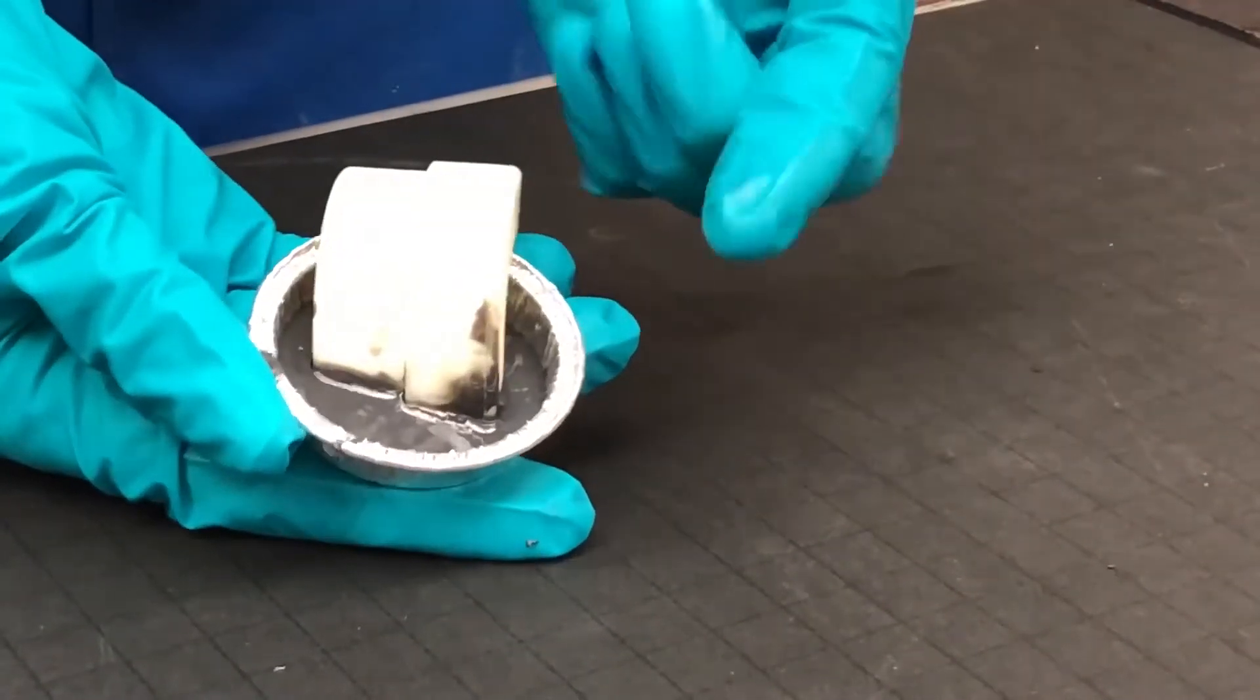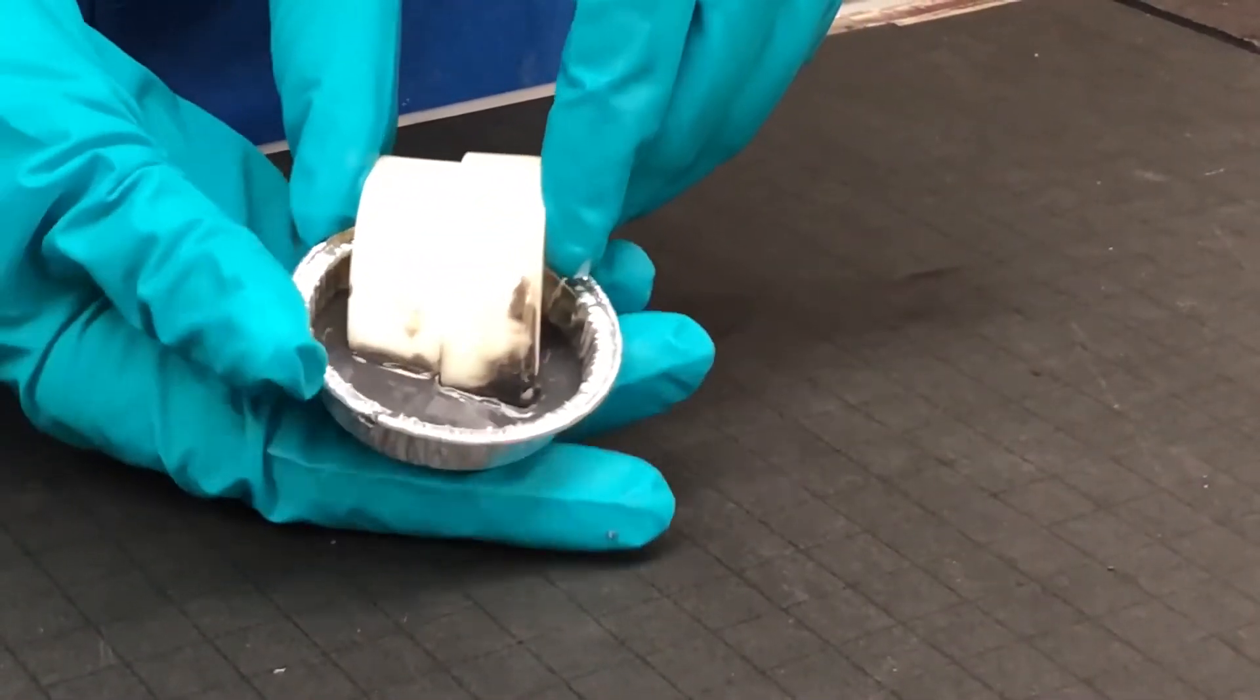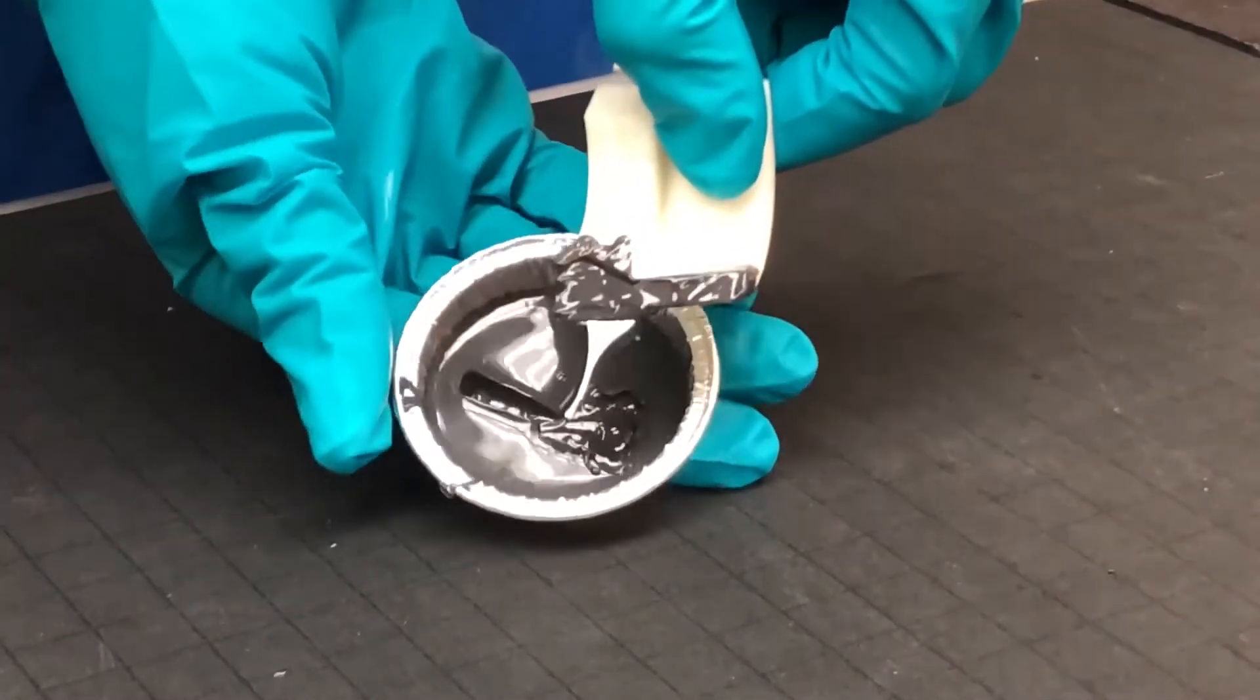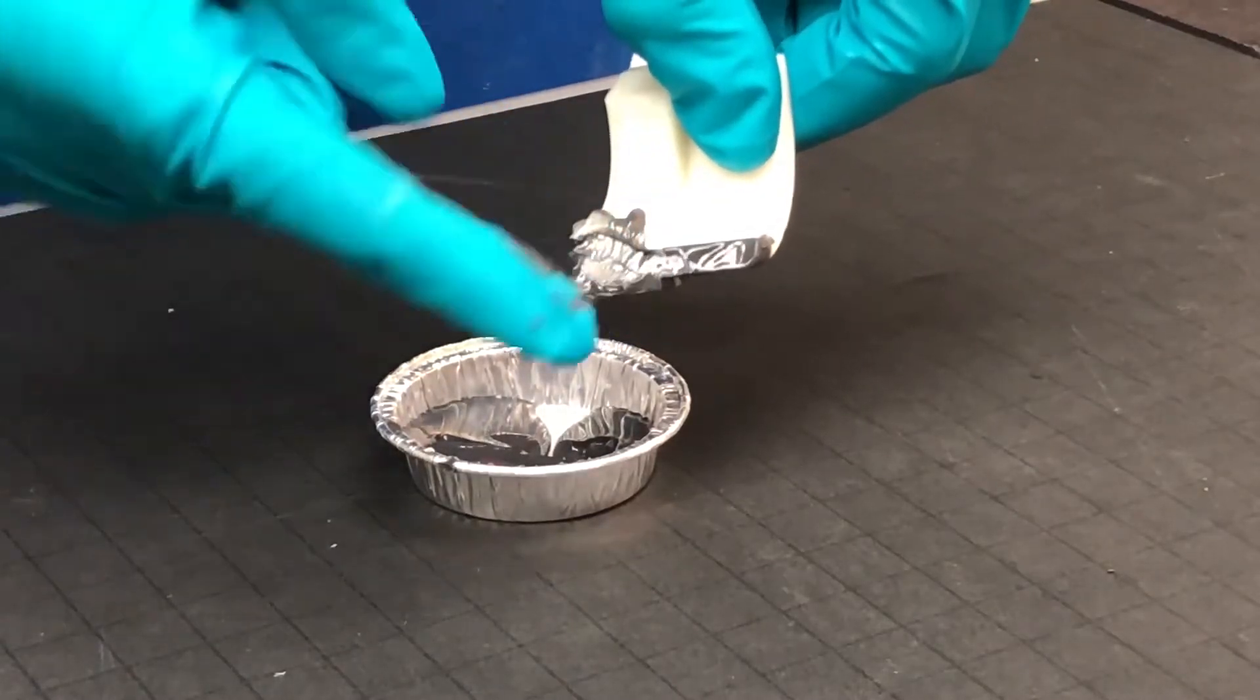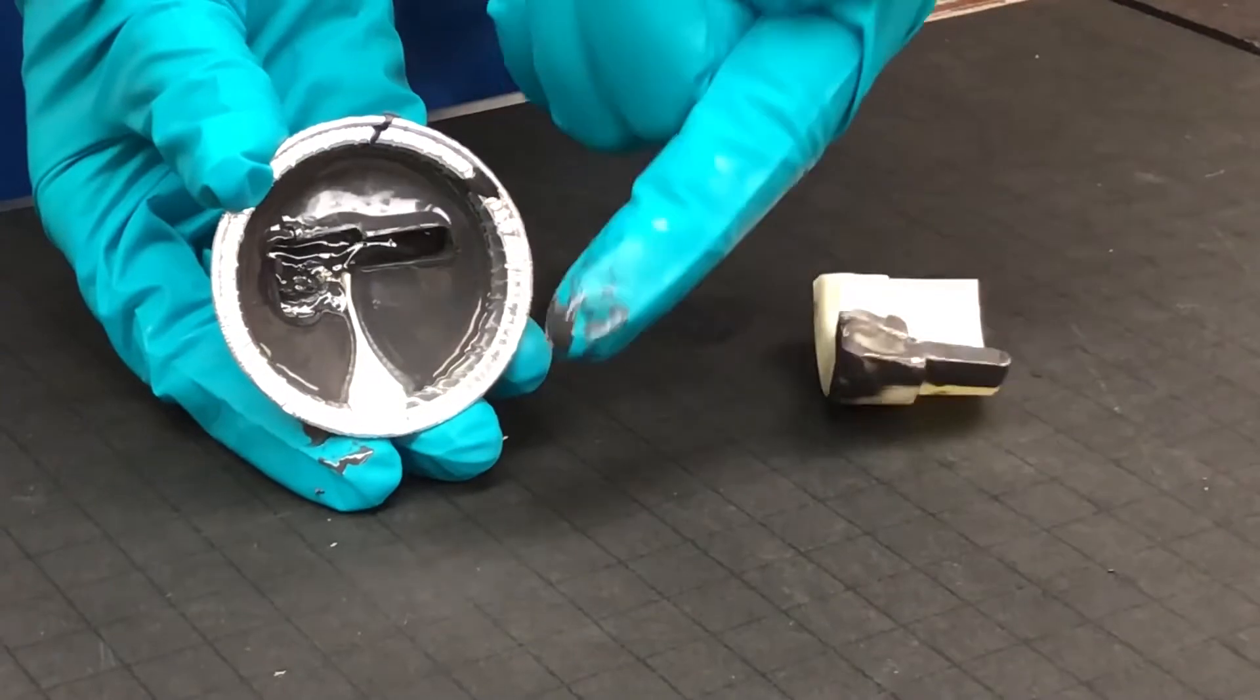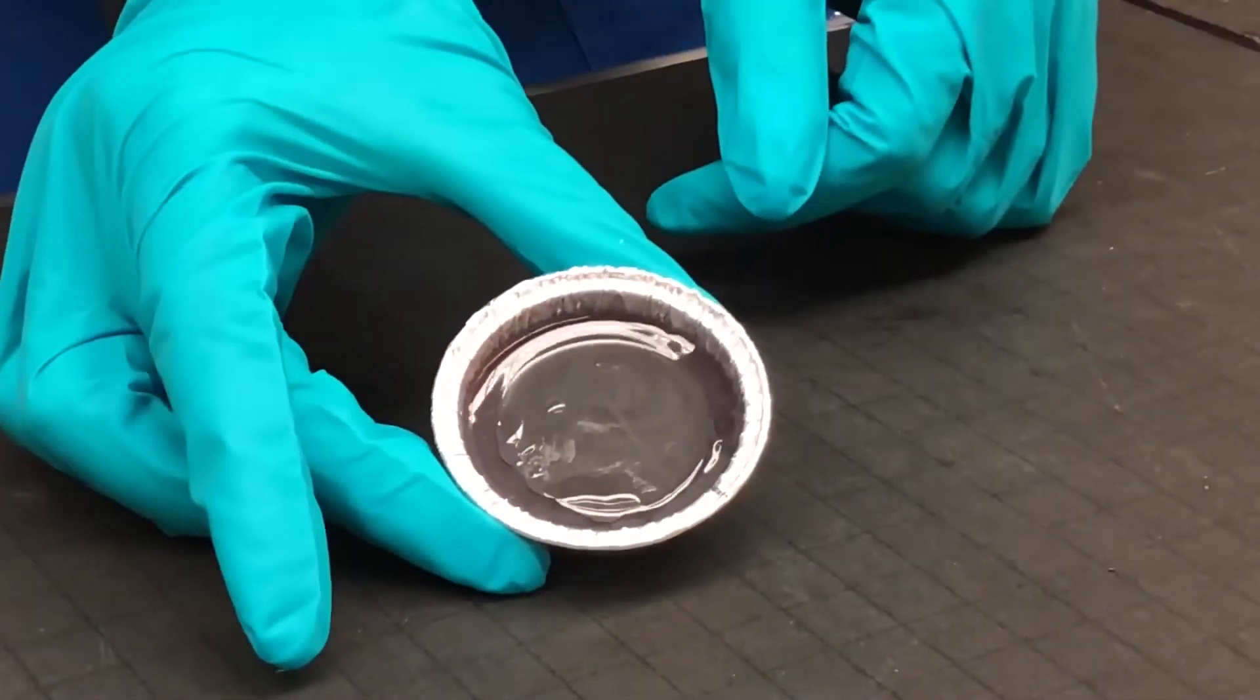Occasionally, customers find that their Addition Cure silicone material did not cure completely. This is usually noticed after the product has gone through its normal cure process, but afterwards, the silicone remains sticky, is too soft, or has areas that remain wet and in a liquid state.